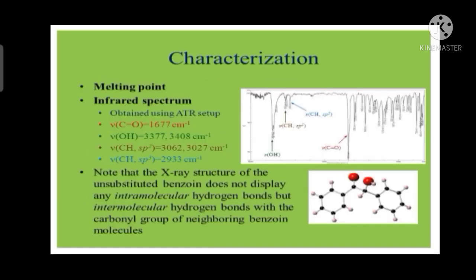Then here are some of the characterizations - the melting point, the infrared spectrum, etc.